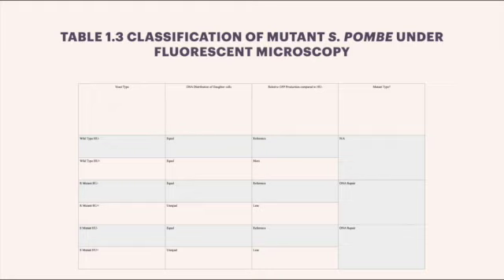For the relative GFP production compared to the HU minus in the S mutant, the HU minus is the reference once again, and the HU plus showed less GFP production. This will also lead us to believe that the mutant type is DNA repair. Both mutants were determined as DNA repair based off of the characteristics under the fluorescent microscopy.